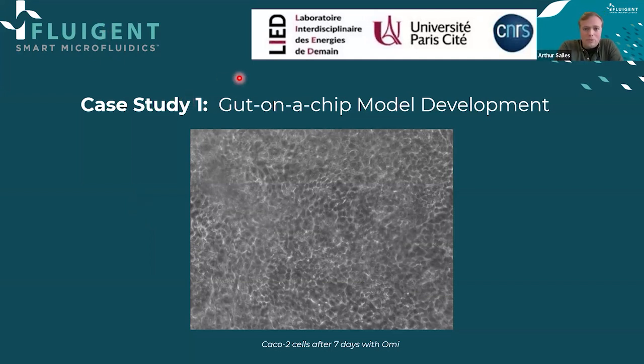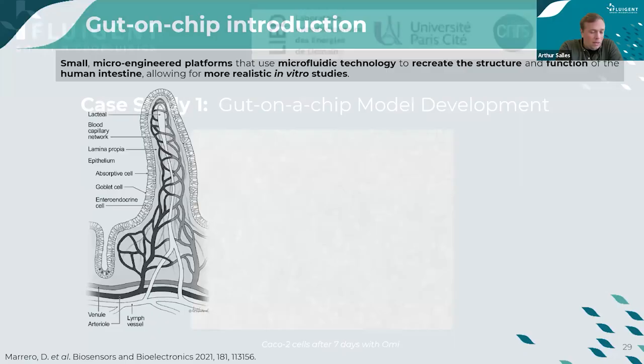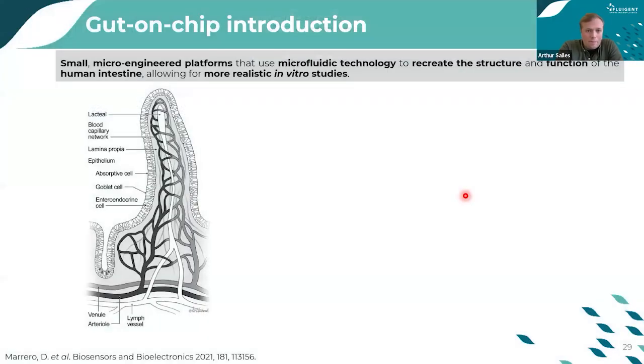So now I will present to you the first case study about gut-on-chip model development. So let's start with a quick overview on what is a gut-on-chip. And especially, the gut-on-chip models are a powerful tool for investigating the physiology and the pathology of intestines.